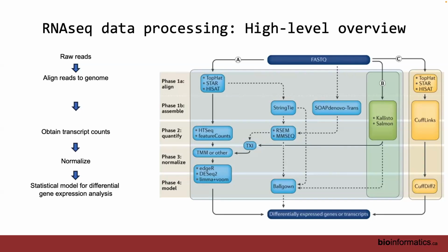So there's stochasticity in how the sampling occurs, right? But then you normalize for it by dividing by the size of the library. So you just see that this sample has twice as many reads overall, and you just normalize it so that every library size is like 100 reads. Yeah, that's right.